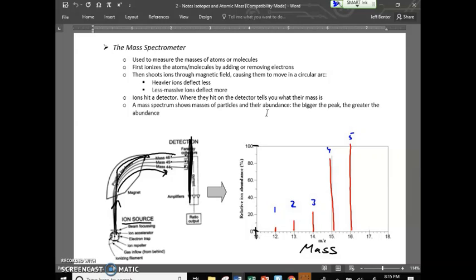And so if you look on the periodic table, you'd be looking for atomic mass somewhere between 12 and 16, but closer to 16. So if you do that, it looks like it could be, I guess oxygen would be the best guess. Although it's not. This must be a made up thing here. Okay.